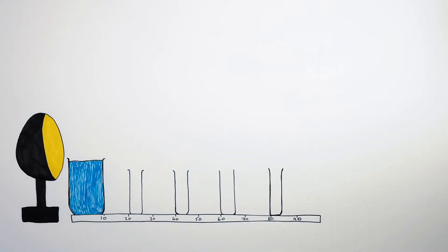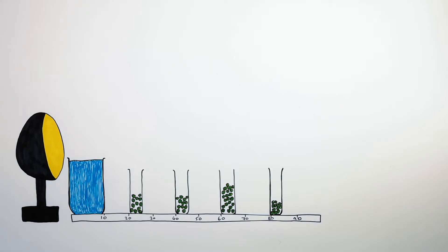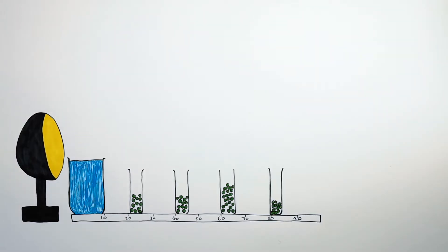You now need to fill each flask with the same number of algal balls. This is a control variable so that your results can be comparable. As you can see, in the first, second and fourth flask there are the same number of algal balls. However, the student made a mistake and put in too many algal balls in the third flask. We're going to see the effect of this later.